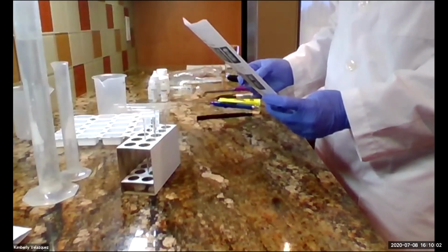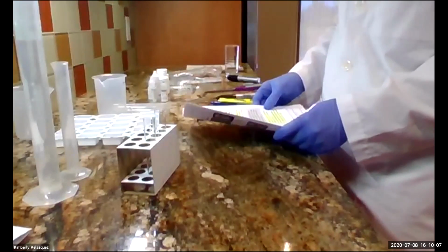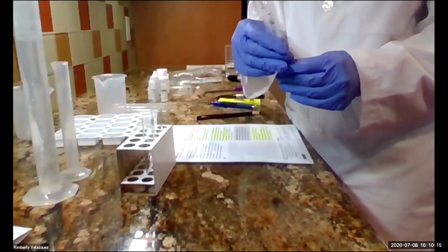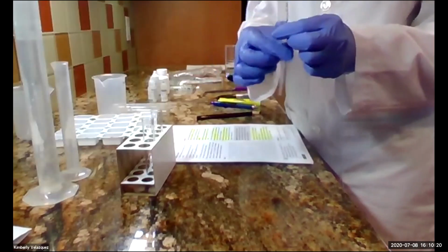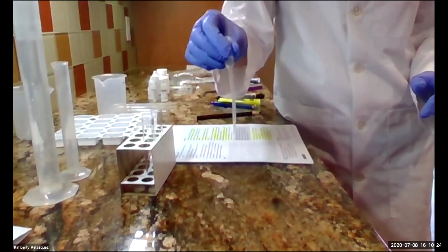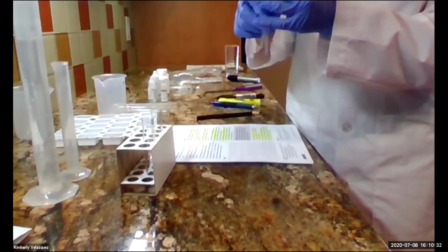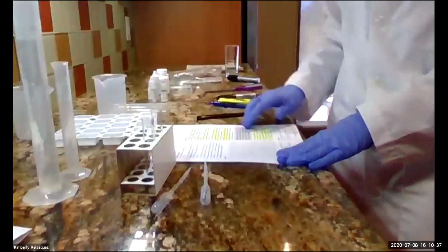Okay, then you're going to take 2 of the 1 milliliter pipettes and label those as well. Those 1 milliliter pipettes are the ones that come in your general equipment bag, not in the pH lab bag. Okay, so one of those I've labeled hydrochloric acid and one I've labeled sodium hydroxide. These work by squeezing the bulb and they suck up water when you squeeze the bulb, and they also dispense water. And you can see there are measurements on the side for measuring liquid. Okay, so you label those and set those aside also. I'm just going to put those by my rack.